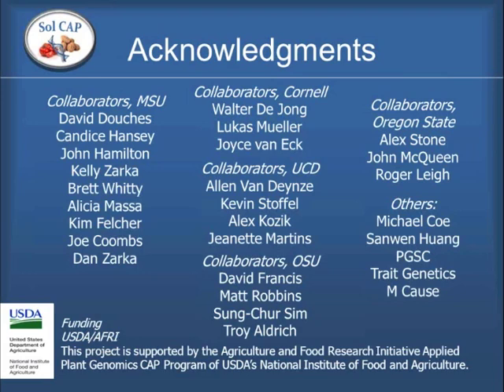Dave? Dave Francis is pointing out that there is a cluster file, so you can go to that, and you don't have to reinvent it. So Robin, the three-cluster call is up on the site, and the five-cluster call will be up when it's finalized. And I think there's also one that's going to be going up for tomato, right?